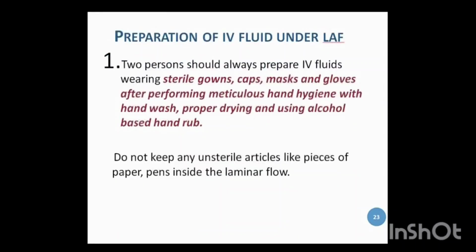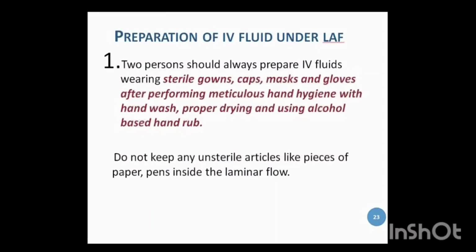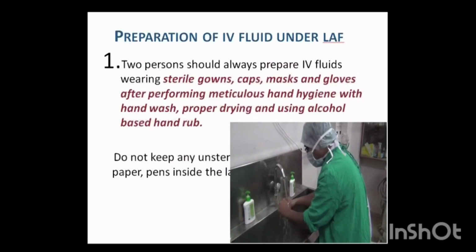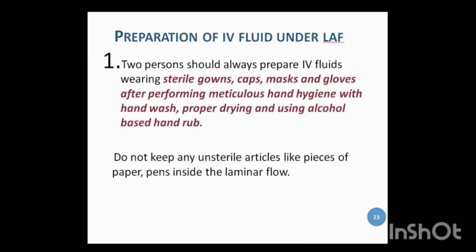For the next section, under the objective, we will show you how to prepare the IV fluids under laminar airflow. We'll go through a number of steps, of which step 1 is that the 2 persons who are preparing IV fluids in the laminar airflow should always wear sterile gowns, caps, masks and gloves after performing meticulous hand hygiene with hand wash, proper drying and even using alcohol-based hand rub. Remember to not keep any unsterile articles like pieces of paper or pens with you.